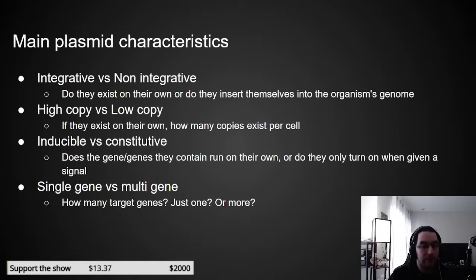And also, if you're designing DNA with multiple genes, there's a lot of quality of life stuff that you really want to include to make physically working with the DNA easier. Because if you ever need to make a change, there's nothing more annoying than spending hundreds and hundreds of dollars to have a huge piece of DNA printed, and then realizing you have no easy way of fixing it because there's an error. So, like I say, there's a lot of quality of life stuff that you've got to do.